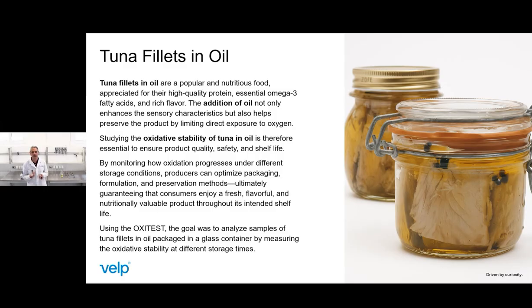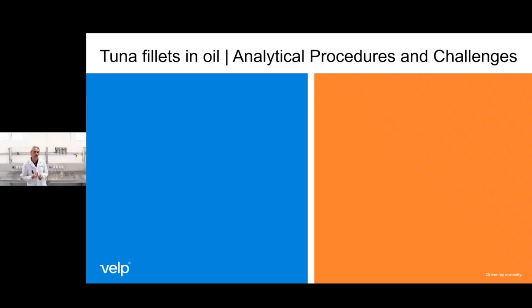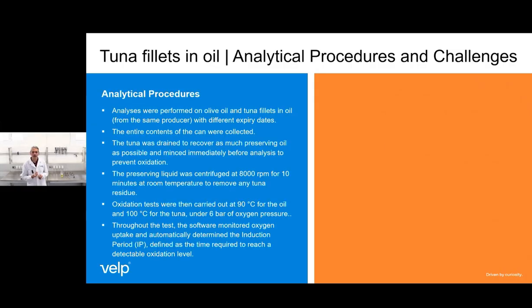Using the Oxitest reactor, we are able to evaluate the induction period and monitor how the induction period varies as the oxidative state of the sample varies. The analyses were conducted on 4 experimental groups.